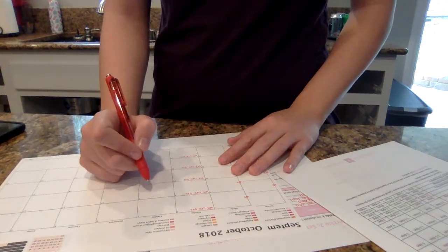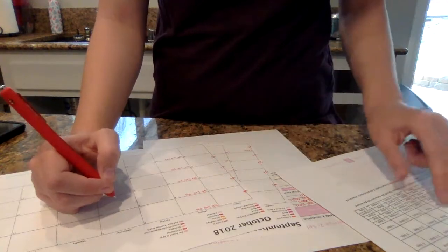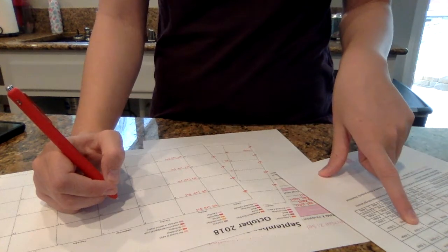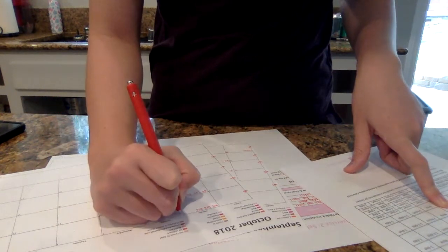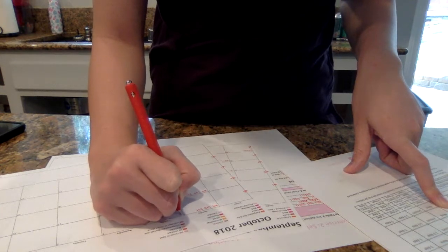For week 5, the biochemical testing for micro-identification needs 1 to 3 days for an active culture. No plate pouring. It's a 3-hour active time, 1 to 3 days of incubation. So I'm going to start on a Tuesday again, like I do with all my active cultures that require 1 to 3 days.